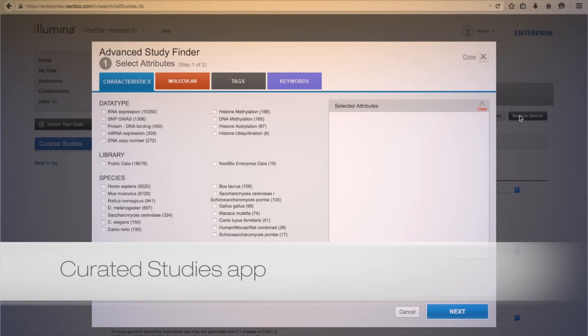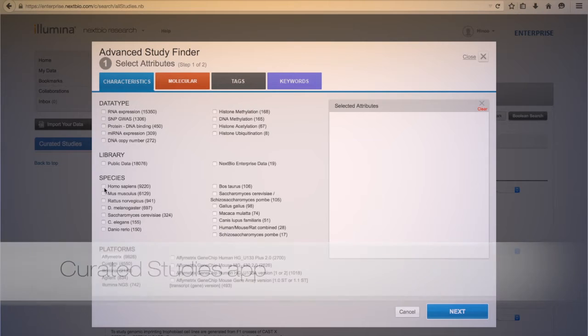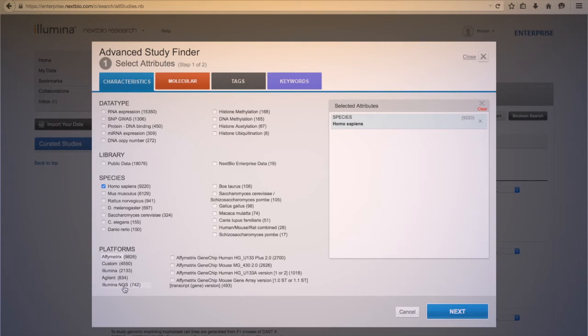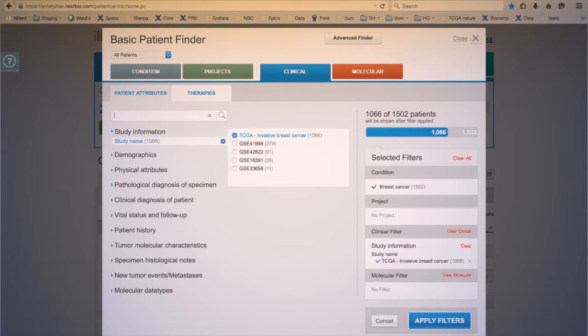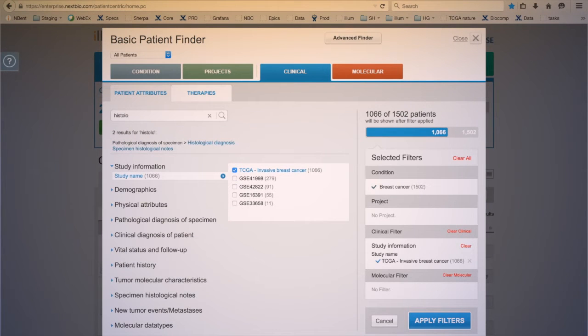Search by gene, SNP, sequence region, biogroup, bioset, phenotype, compound, tissue, or keyword. Or do a text-based search.